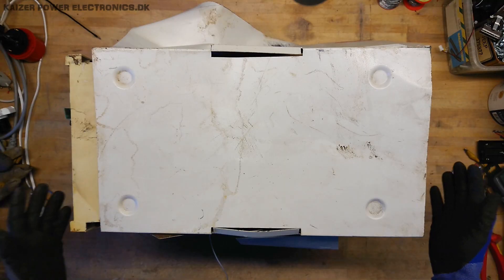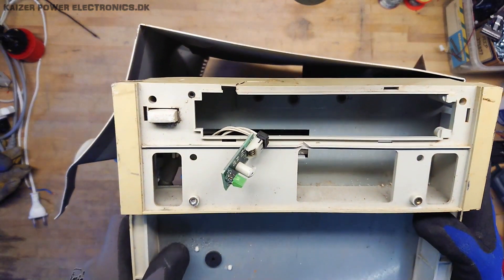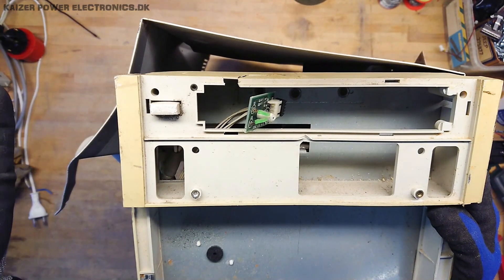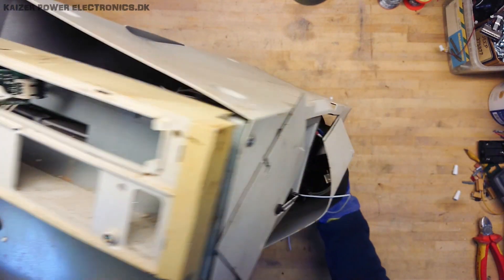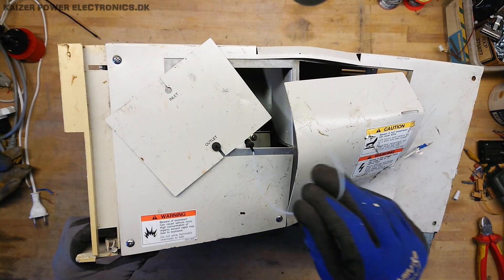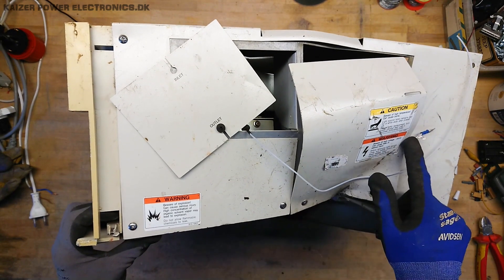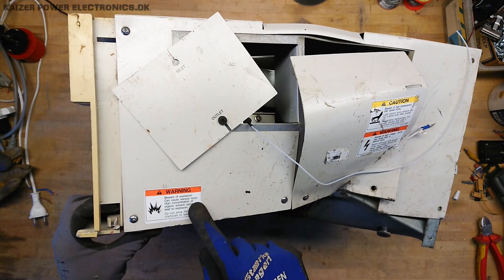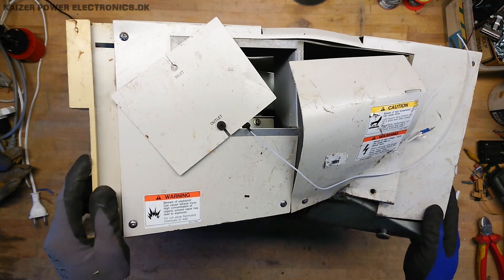Let's start with a quick overview of the unit. At the front there is nothing more than two status LEDs and an on/off button — the whole front is just a plastic shield. At the side we have an outlet for the liquid to be analyzed. It has some nice stickers: beware of high voltage 500 volts, beware of high temperatures that can cause burns, and beware of explosions — high concentration of organic solvent vapor may lead to explosion.